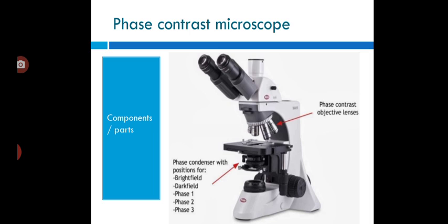Next is the phase plate. It is either a negative phase plate having a thick circular area or a positive phase plate having a thin circular groove. This thick or thin area in the phase plate is called the conjugate area. The phase plate is a transparent disc.